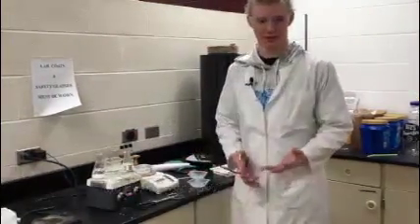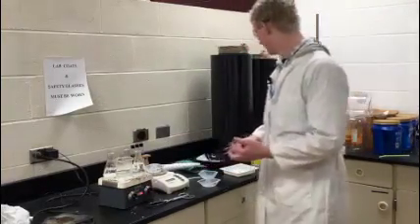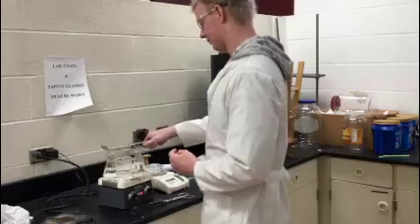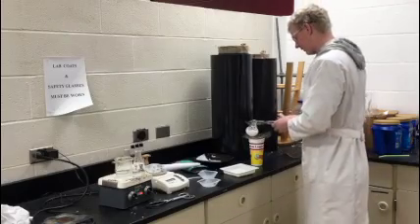Now that our boiling water is done, we are going to take it off the hot plate and pour it out. It is hot, so do not touch it. We are going to take it out and pour it out here.